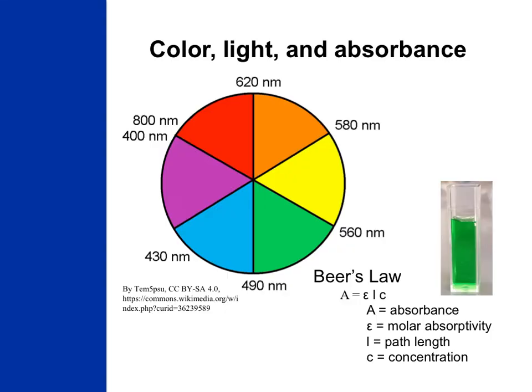In this experiment, we're going to be using our knowledge of color and oxidation states to determine which DNA monomer is the best oxidizing or reducing agent. Remember, the human eye perceives all mixtures of colors. When all colors are present, we see white light. When one is missing, we see its complement, that is the one that's located across from it on a color wheel. So when red wavelength photons are absorbed, we see the color green, its complement. Or when yellow photons are removed, we would see purple.